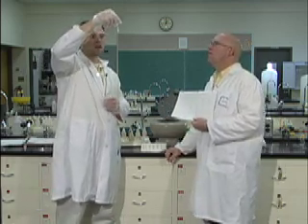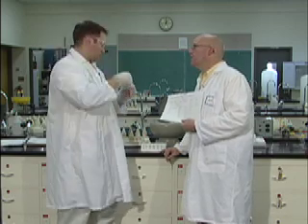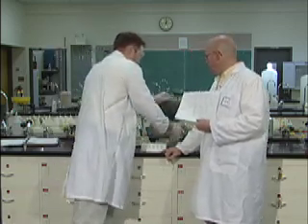Oh look, there's lots in there. Oh, we're good? Yeah, oh yeah. All right. So again, at this step it's important that you centrifuge very, very well. So we're going to leave this one for a little bit longer, to separate out the two. Separate the aluminum from the iron.